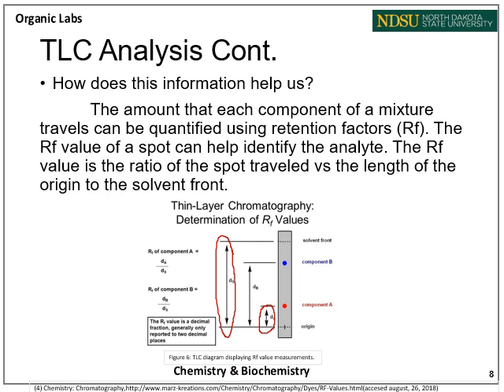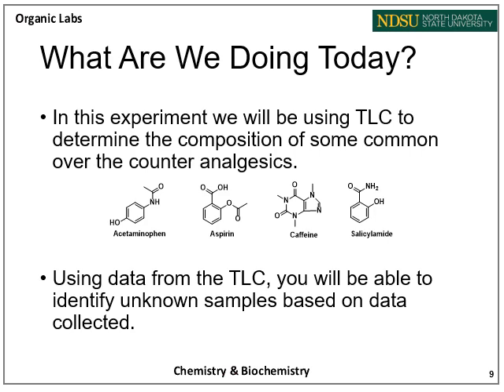You can then use this retention factor to compare to a known standard to identify what component A is or most likely is. So that brings us to what we're actually doing today finally.